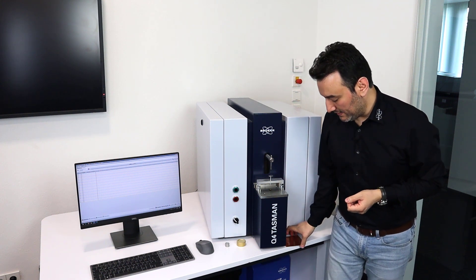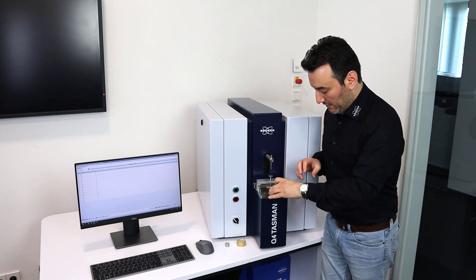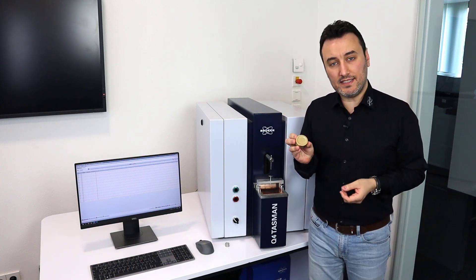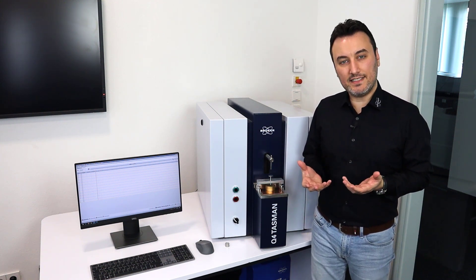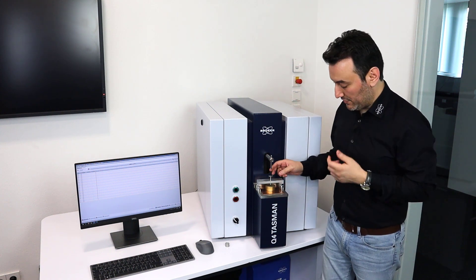I can just place my metal sheet here on the spark stand plate. Then I can use this brass disc and place it on top of the sample. This brass disc actually works as a heat sink to absorb the heat created during the analysis — that's its sole function.